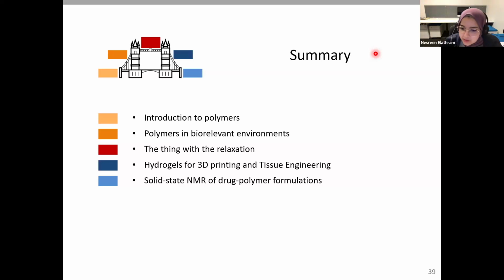Oh yeah, there's another question. Can DOSY-based methods be useful to investigate drug release? For example, a micelle broke and the content entered the solution.